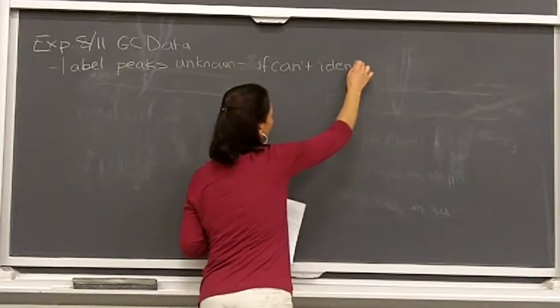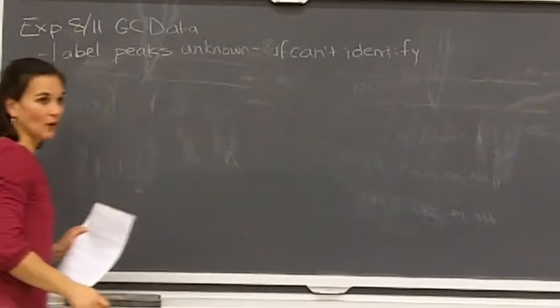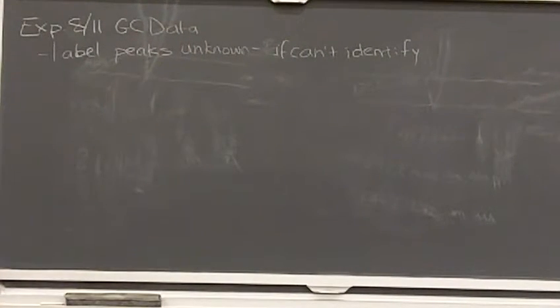However, be careful with that. Make sure that they are actually unknown. So remember, if you have trans products, you'll have cis products somewhere, okay? You're not going to have all trans products. If you have cis, trans, cis, and you're missing a trans, the trans is probably in there somewhere, so don't forget to label it. Don't forget about the ketone that comes off a little before your alcohol.